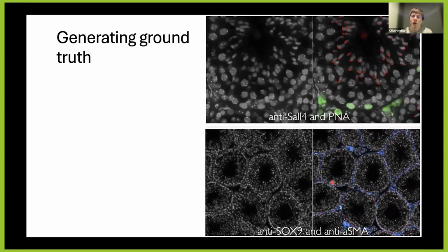So how to actually, yeah, it was kind of an interesting assignment, not an assignment, it was actually a hobby, to start to try to build a model that could do this classification on its own. So how to do it? You need human labelers for it, and you basically feed in these DAPI-stained images where the nuclei are seen.